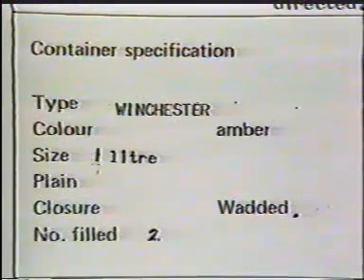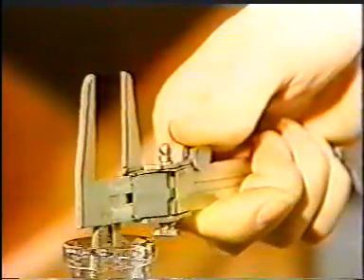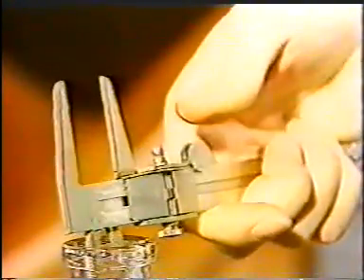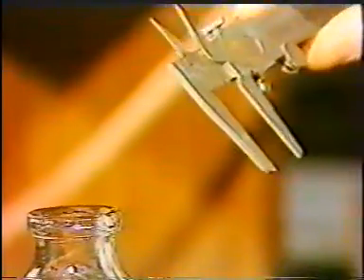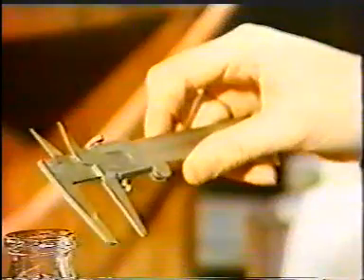It is necessary to set standards for packaging materials in the same way as it is for raw materials. For bottles, the material is specified together with the dimensions and the allowable variations. This is particularly important in the case of glass bottles, used in the manufacture of heat sterilized products. The dimensions of the neck are especially important because of the necessity to achieve a good seal. Standards are also set for closures.